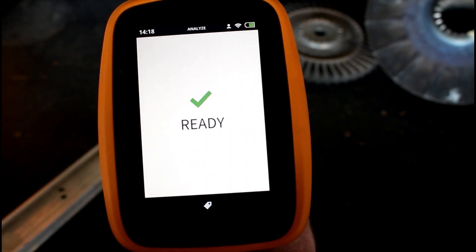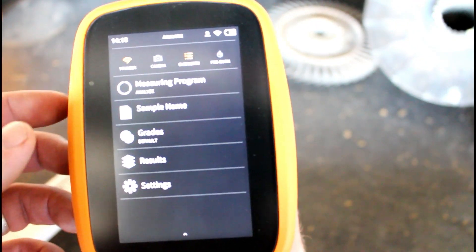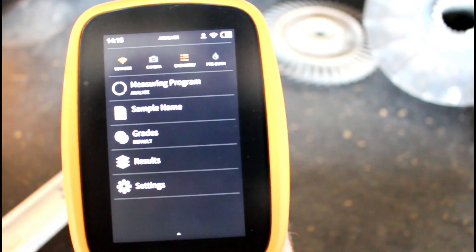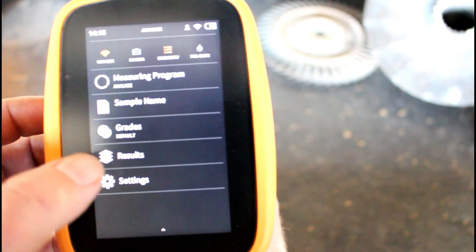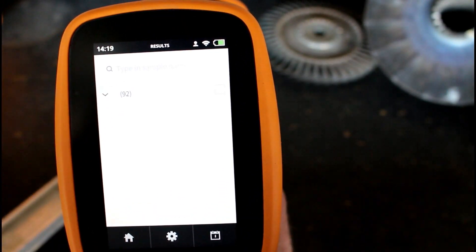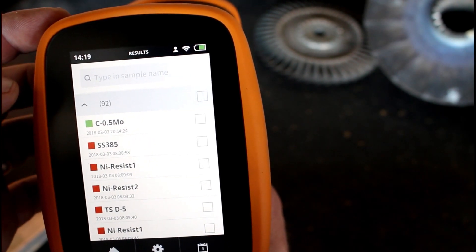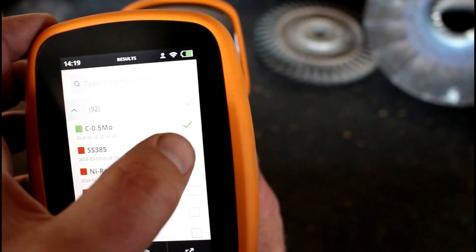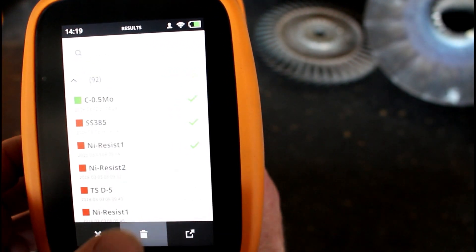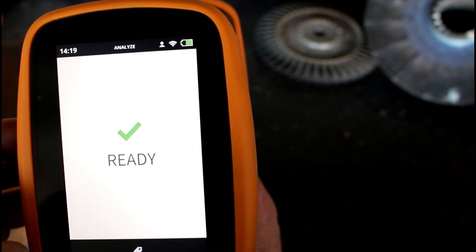I really like this thing because it's so user friendly. The touch screen is awesome, it works great. It's got all these different options you can do — I'm still messing around with it and Vidal's showing me how. A lot of stuff is just common sense. On this one you can go to the results page — that gives you all the results that you've shot before. You can click on them, send them to somebody if you want, or just delete them. It's just really user friendly and that's why I like this thing.